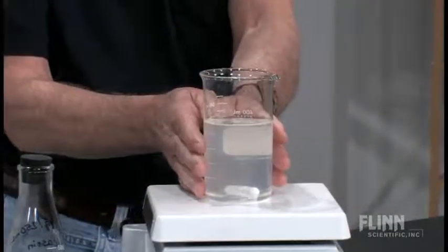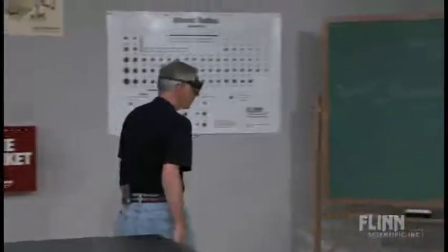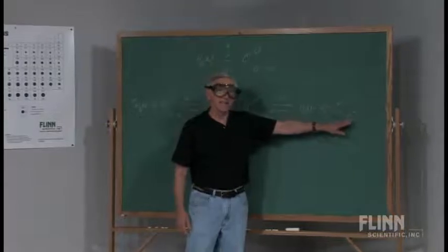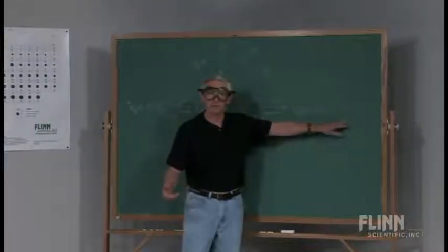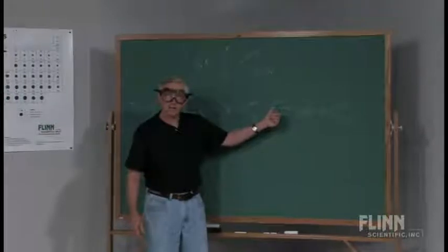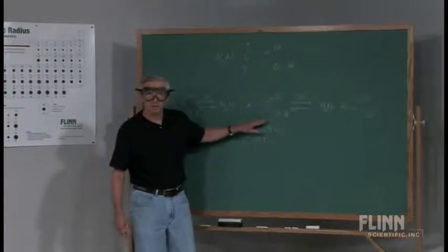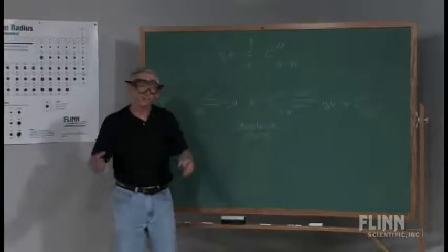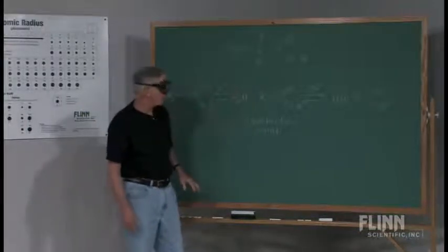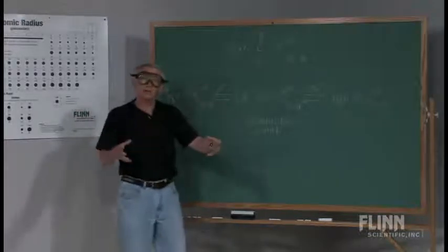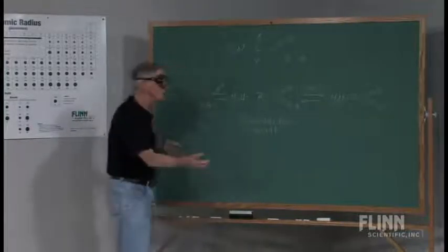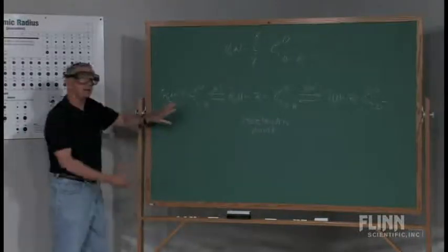At this point, remember it's slightly basic. The presence of excess hydroxide makes this end ionic, which improves solubility in water. What I'm going to be doing is neutralizing that excess hydroxide, which is going to bring me back to the isoelectric point. The problem is it's not soluble in water there — this end might be suitable for water, this end will react with water, but the stuff in the middle is so big that you'll see the solution get much more cloudy. So I'll keep adding acid, bring it over, and we'll see it clear up again.